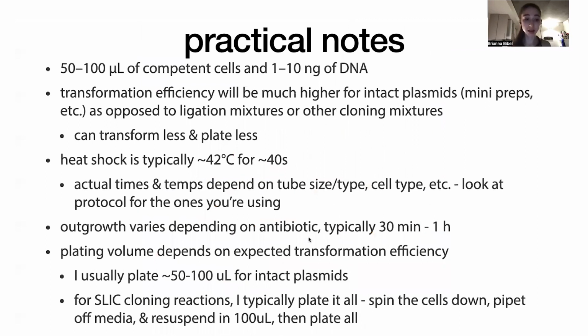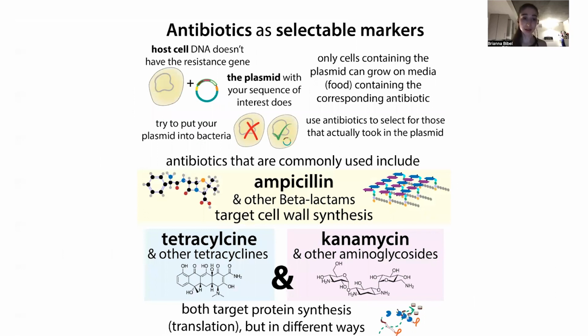Okay, so the amount that you're actually going to outgrow the cells is going to depend on what antibiotic you're using. The antibiotics are going to be really important because we're going to use them to allow only the cells that take up the plasmid to grow.